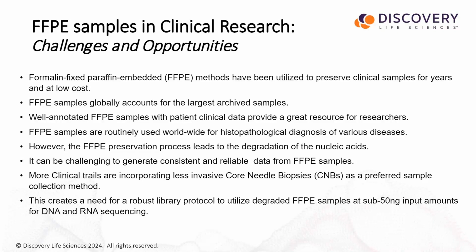Apart from that, most of these FFPE samples are well annotated, with patient clinical data or histopathological data. These samples thus provide a great resource for researchers.